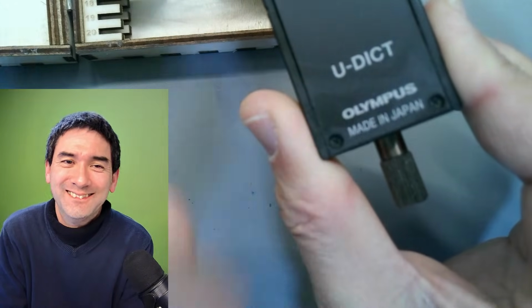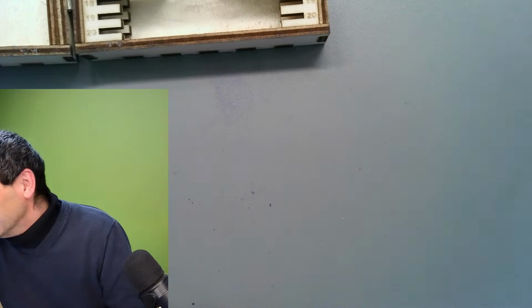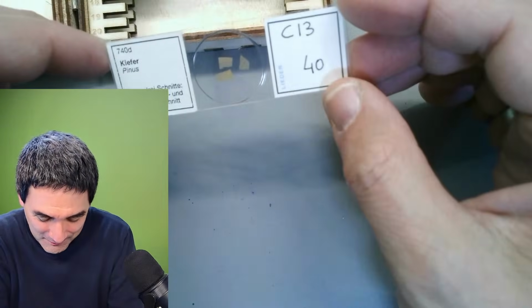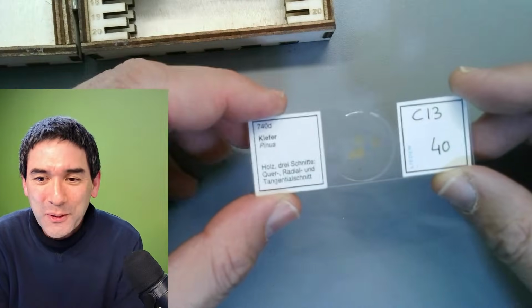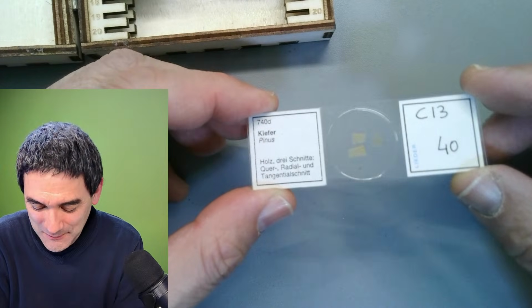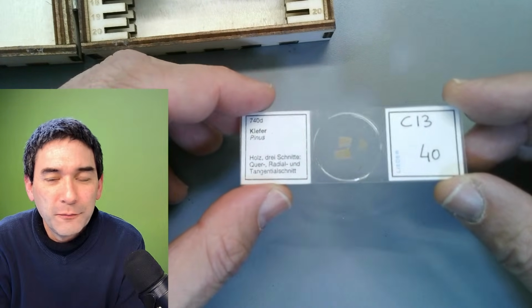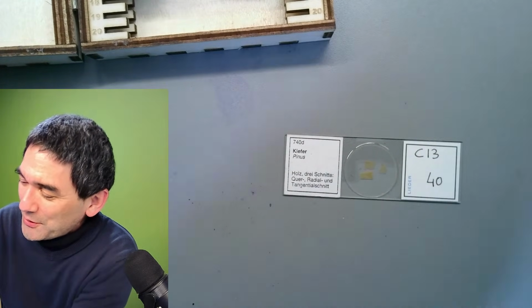They have their own abbreviations. This one is another nice one over here. This one is wood, in different sections, and there's also one of those slides where you can make pictures.